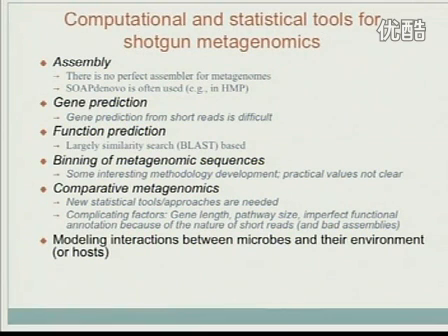So why is the assembly of metagenomes so different? It's not that different. Ideally, you still try to use the overlaps between the reads. But if you work with a whole community, there are many species that are similar to each other, so they're just like pseudo repeats.